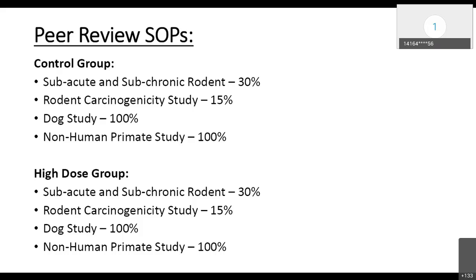Whereas in the case of rodents, up to a 90-day toxicity study would have 40 animals, and there it may not be feasible to examine all animals. So since the number of animals employed in dog and primate studies is small, we examine all animals, all tissues. Next one.